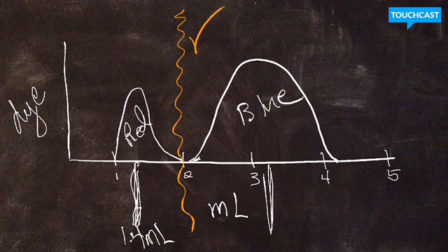All right, so let's go on to part C. In part C, they want you to calculate something called the capacity factor. The capacity factor is basically a number that represents how attracted the dye is to that Sep-Pak material. This is kind of like a way to measure the overall polarity of the dye. The higher the value, the more non-polar it is because it can be stuck inside of the Sep-Pak. The lower the value is, that means it's more polar and it wants to push through first.